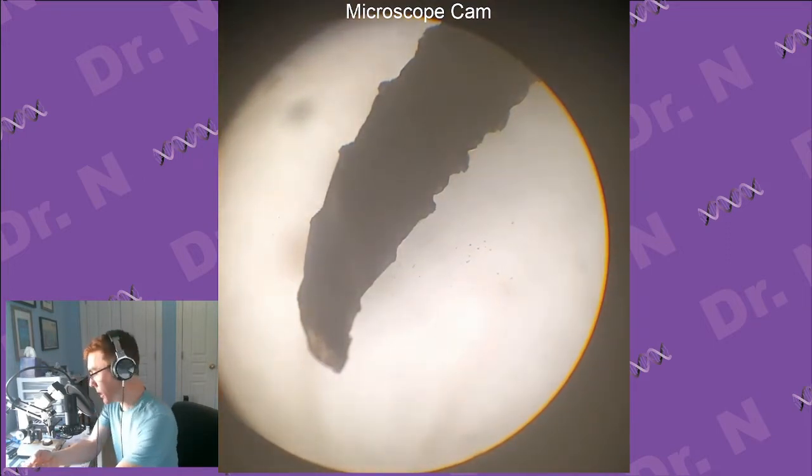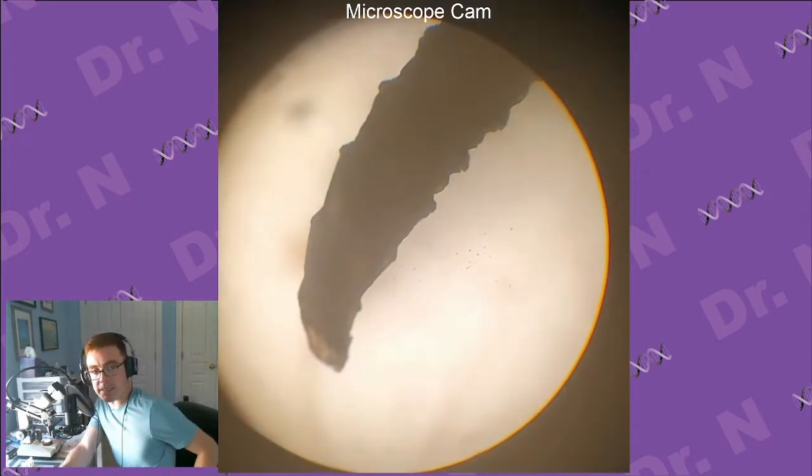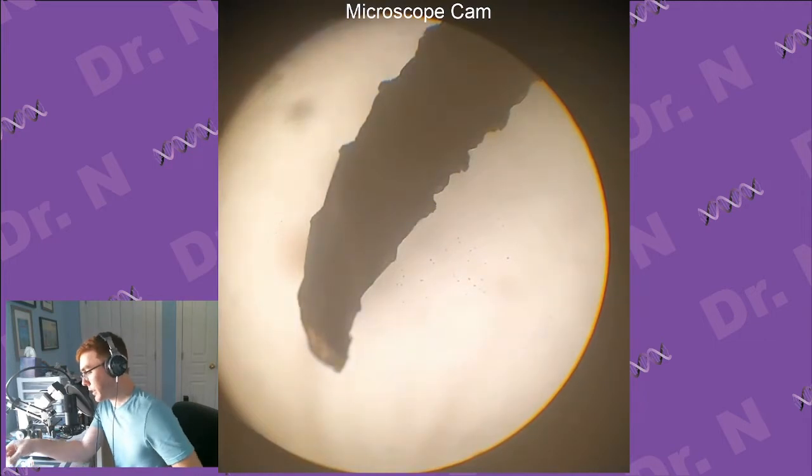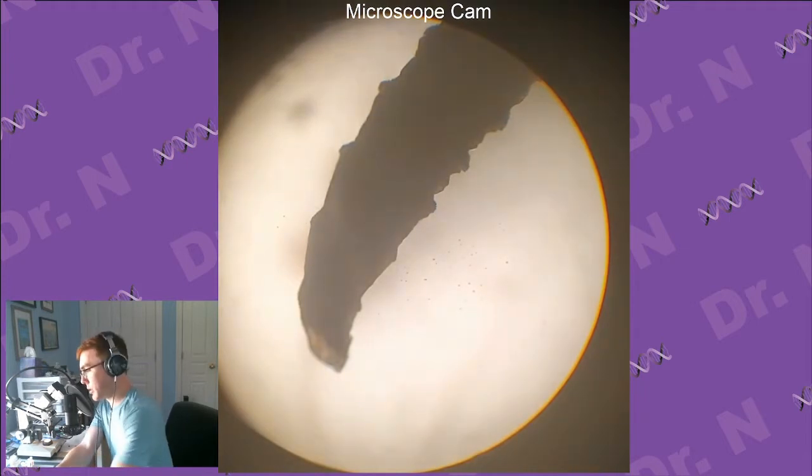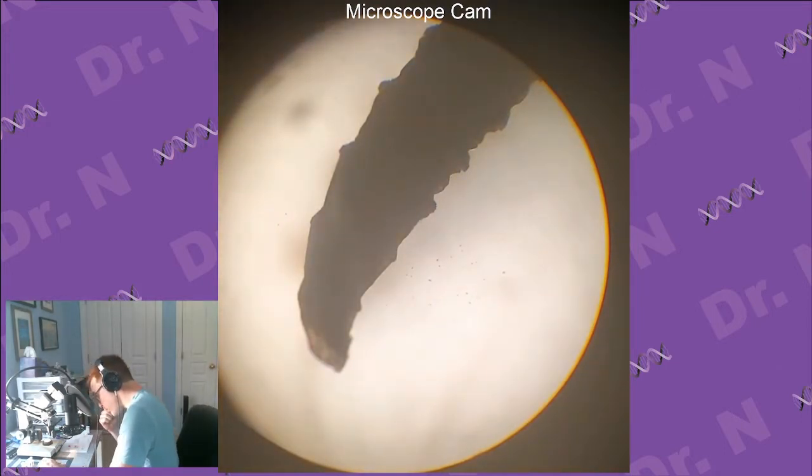So it'll probably take me a couple tries to get it. This microscope isn't a dissecting microscope, so it's going to be pretty tough to see what I'm doing, but I'll kind of take a guess at it. And also, I don't know what exactly preserved larvae are going to do. So in addition to that, I also have these living larvae in this tube I have at my desk. These guys I'll be able to grab out fresh. They'll wiggle around, but we should be able to get something from them, even if I don't get anything from this. Okay, but I just kind of have to decide how to do this.